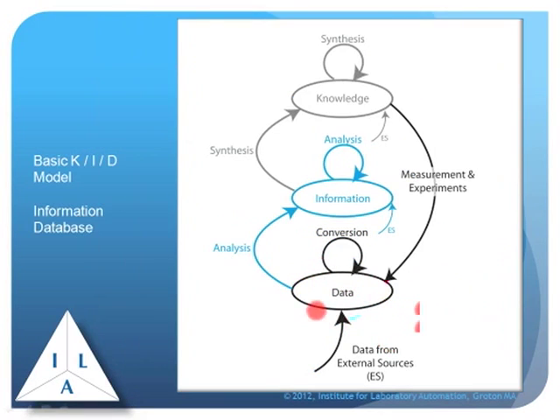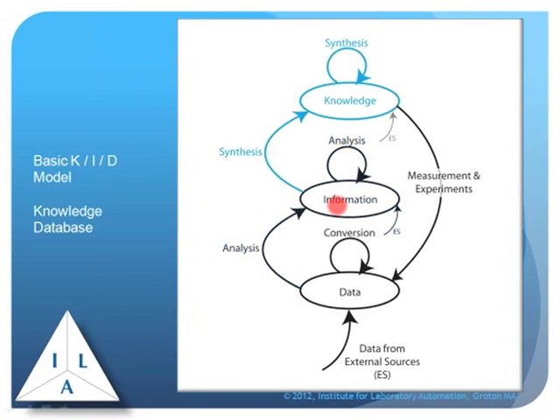The computer system now would go off and take the data that's in its database, perform an analysis, and then put the results in the information database. Again, in the 1960s it was paper. Now it's either an electronic laboratory notebook or a LIMS system. And finally, in research applications, we take information and synthesize it to create new knowledge. This wouldn't exist in a quality control laboratory because they don't really create new methods or new knowledge. They're basically a testing organization.